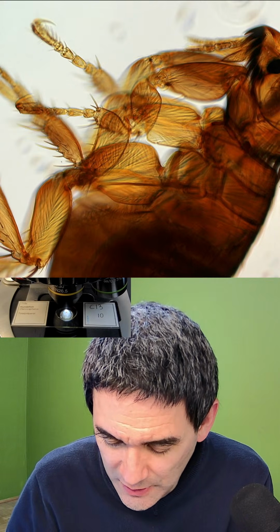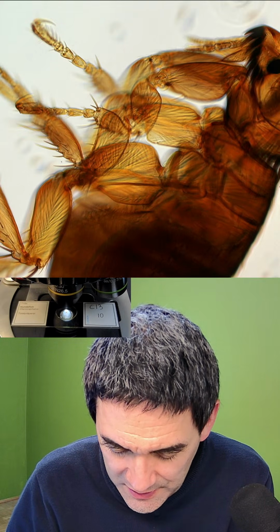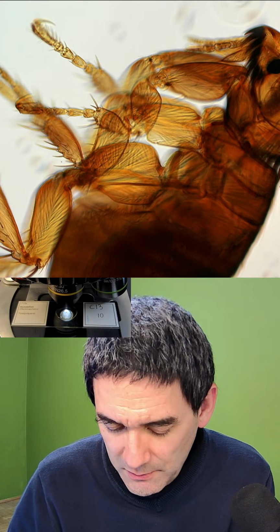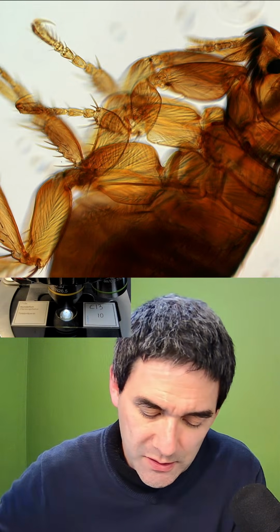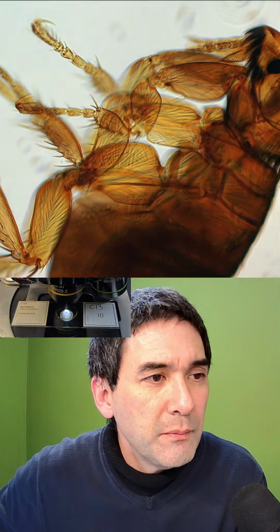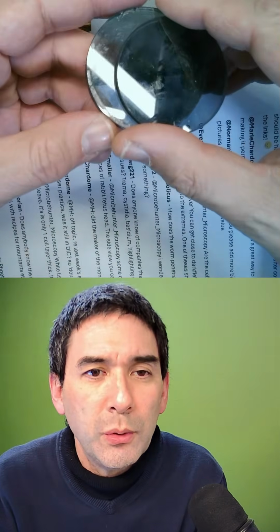In last week's streams, when you showed the viewer the use of the 2 polarizing plastics, was it still in DIC or doubly polarized? When I polarize the plastics, no. What I've done is, briefly, if I remember correctly, let me show you. No, that's the wrong one. I've got some polarizing filters here.